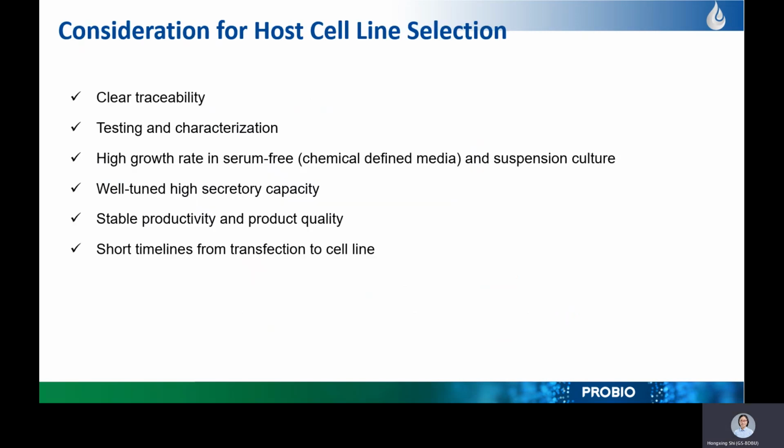Next, let's talk about the key elements of cell line development. For the host cell in the starting technology, there are very clear requirements. First, there is clear historical background information which can be traced well. Second, the relevant tests have been carried out, including identification, sterility, mycoplasma, viruses, etc. Third, it can be well adapted to serum-free suspension culture to meet the need for scale-up production.